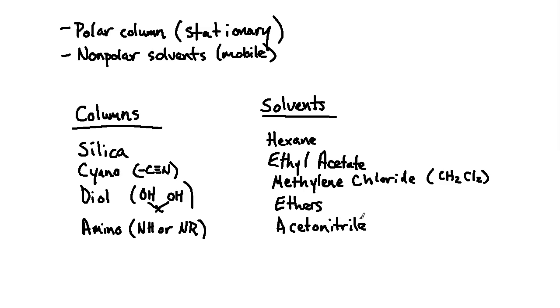Well, now we're coming here and we're saying, okay, start very nonpolar, hexane, ethyl acetate, right? And then we cap out, this is considered the more polar end, right? Mid-level polarity for the normal phase. So you're seeing a meeting in the middle where ethers and acetonitrile can sometimes cross over into both types of HPLC techniques.